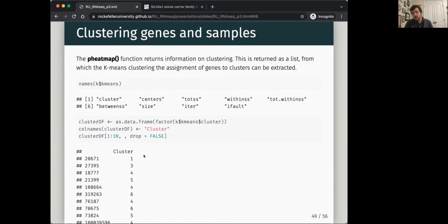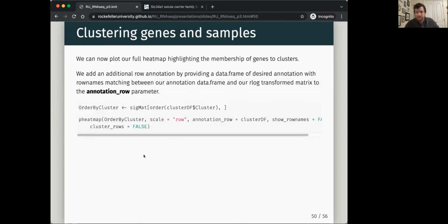So now you know the gene IDs, you know the clusters, and in a separate data frame, you have all the counts. And in another data frame, you have log2 fold changes. And in another data frame, you have PCA values. So you can start to stick these together and do comparative analyses this way.